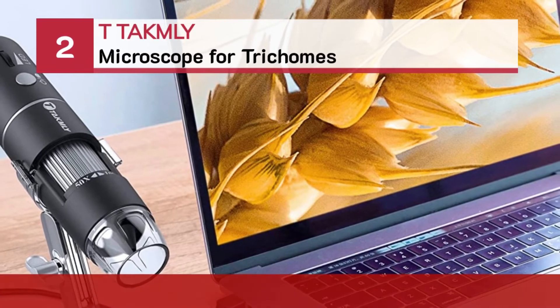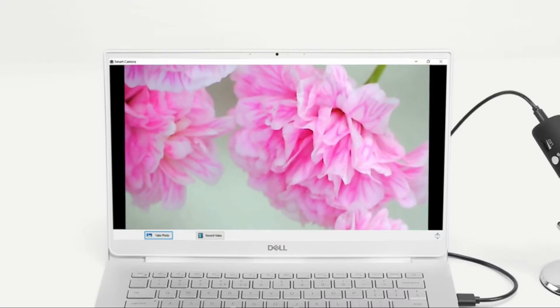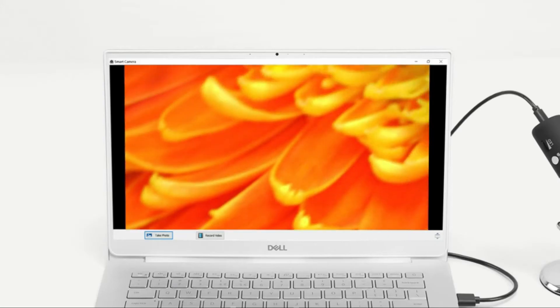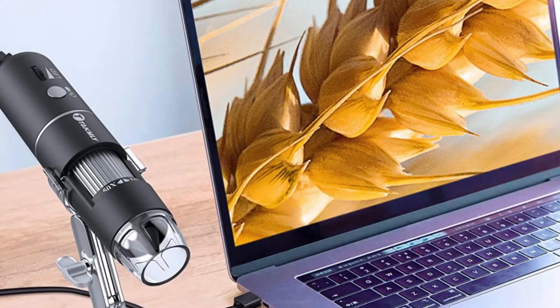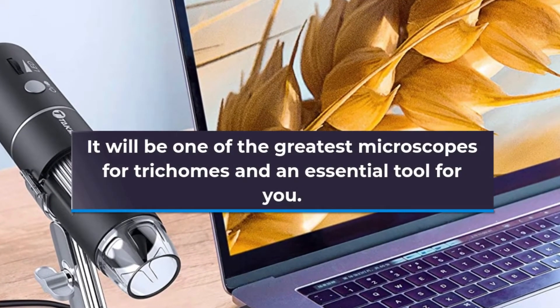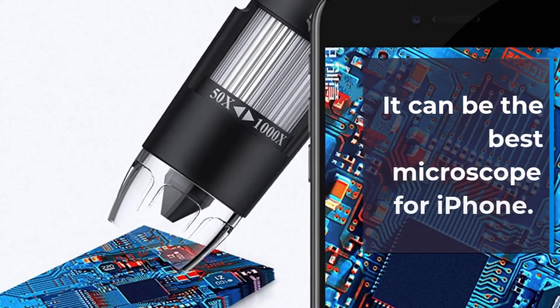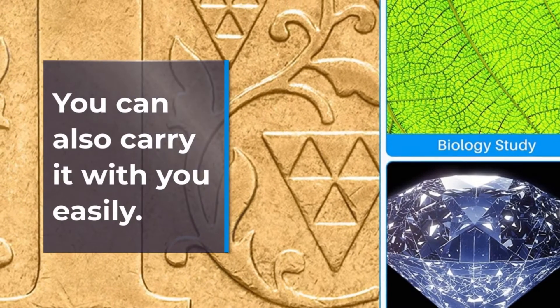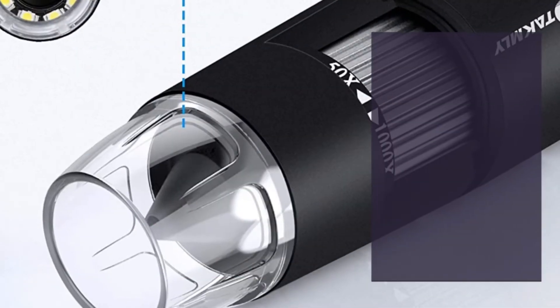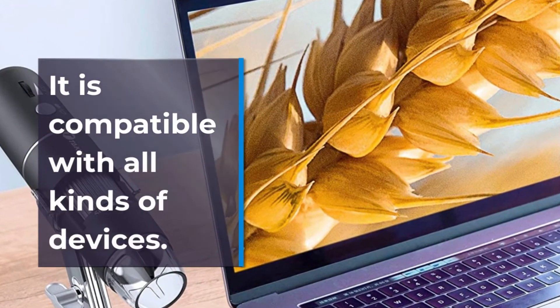Number 2: T Takmly Microscope for Trichomes. It will be one of the greatest microscopes for Trichomes and an essential tool for you. This microscope is very much travel-friendly and can be the best microscope for iPhone. You can easily carry it with you. It ensures more clear and bright images with 8 LED lights and is compatible with all kinds of devices.